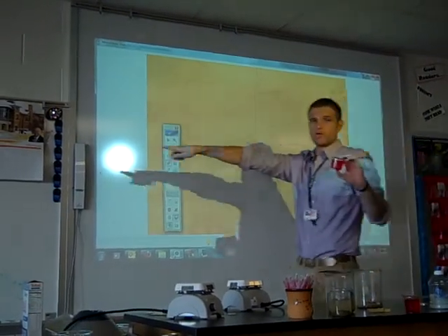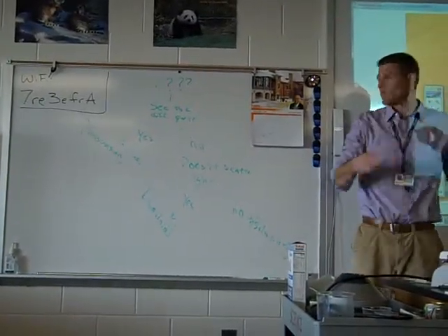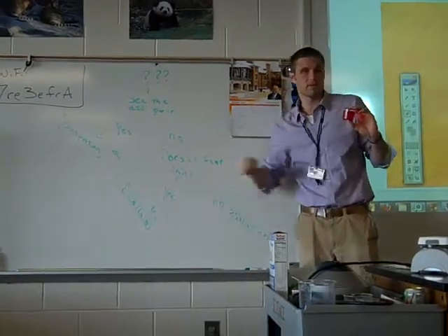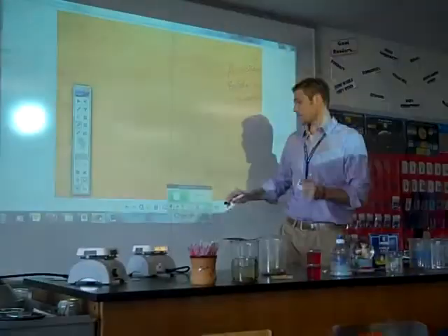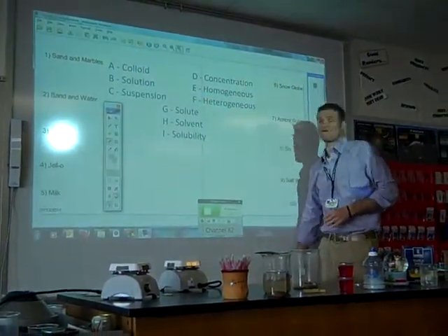Let's go over here, Professor Mullen. Can you see the different parts? No. Does it scatter light? Yes. So what is it? A colloid. Good job. Same question again. Colloids, are they E, homogeneous, or F, heterogeneous?